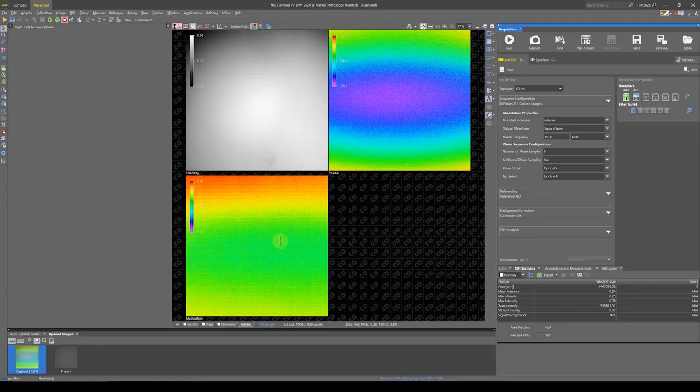The interesting parameter right now is to have a look at the mean fluorescence intensity, because here you see in the ROI statistics that the mean value is about 0.34, which means 34% signal. Now the exposure time for the reference measurement has to be adjusted in a range between 68 to 72% signal. Since I'm at 60 milliseconds, I double the exposure time and take another measurement.